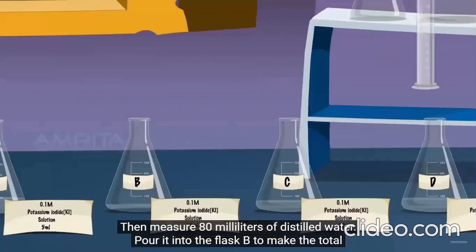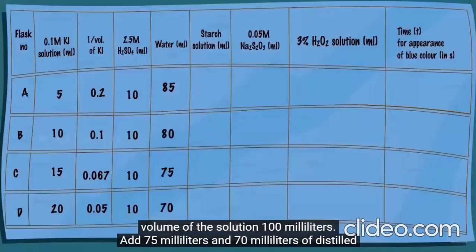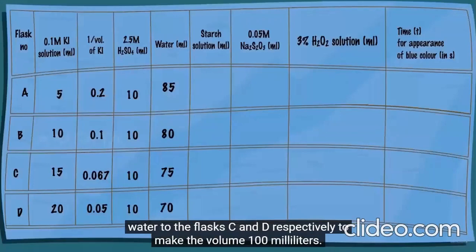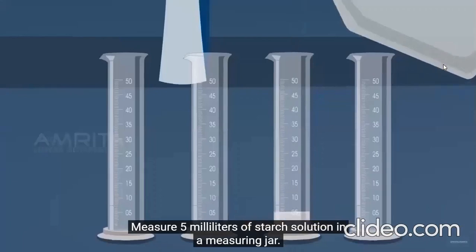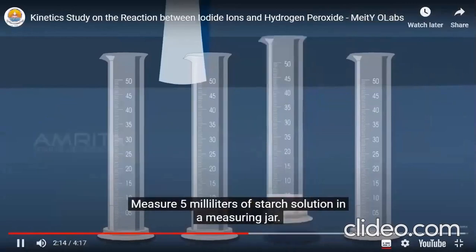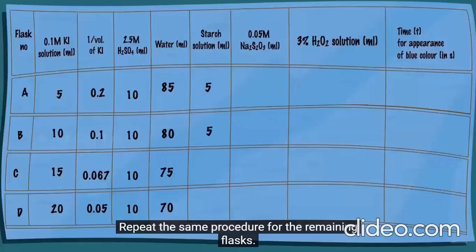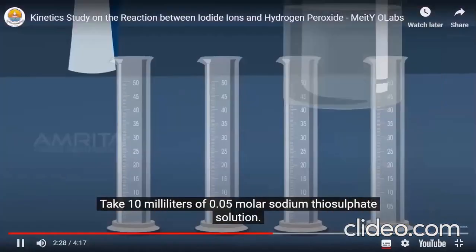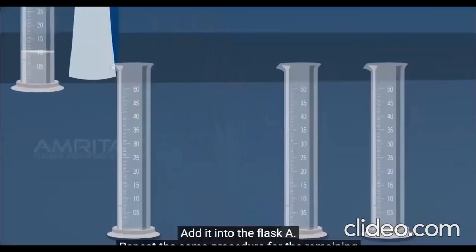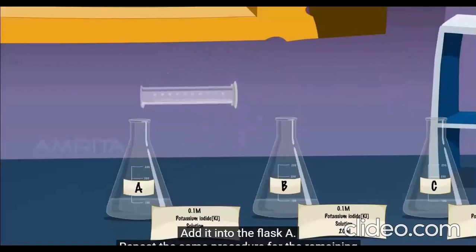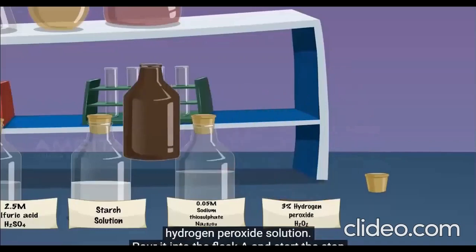Measure 80 milliliters of distilled water and pour it into flask B to make the total volume 100 milliliters. Add 75 milliliters and 70 milliliters of distilled water to flasks C and D respectively to make the volume 100 milliliters. Then measure 5 milliliters of starch solution and pour it into flask A. Repeat the same procedure for the remaining flasks. Take 10 milliliters of 0.05 molar sodium thiosulphate solution and add it into flask A.